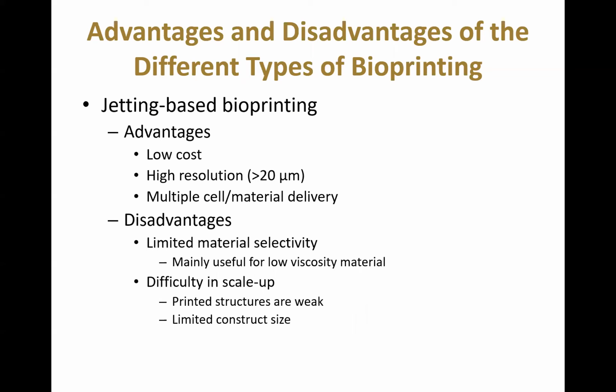And you also have options of multiple cell and material delivery for that bioprinting technology. But some of the disadvantages is that you're really limited on your biomaterial selectivity because you need to use low viscosity materials because you're pushing out small droplets of the biomaterial through a nozzle, and high viscosity materials just don't work in a jetting situation.